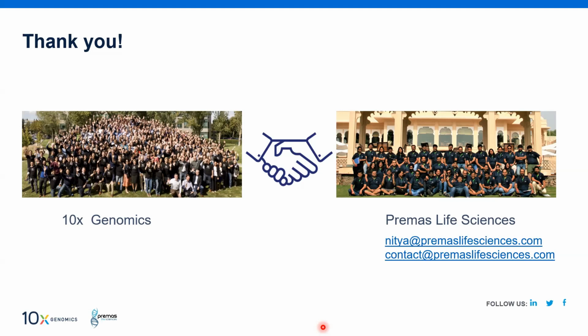10x is coming up with a kit where you can fix the cells for up to 7 days at 4 degrees, and you can start your experiment once you collect those cells.